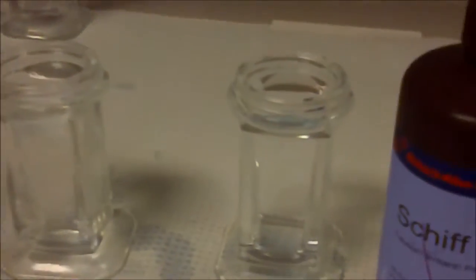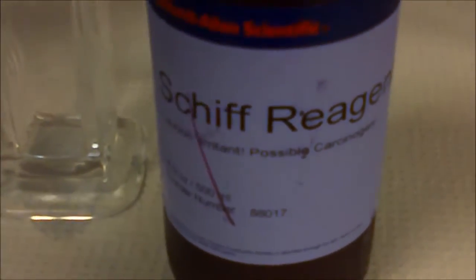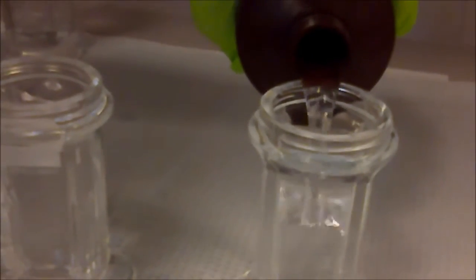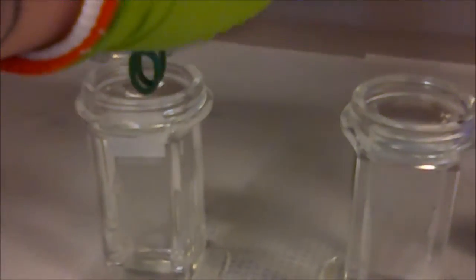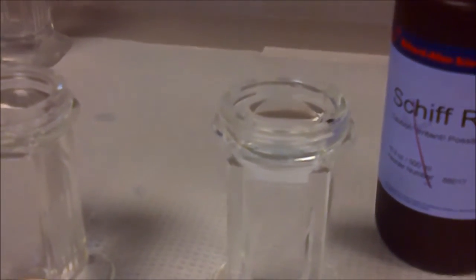Step 4: Schiff reagent. We're going to remove the slide and apply the Schiff reagent for 15 minutes. The reagent has to be allowed to warm to room temperature at this point. We're going to let that wait for 15 minutes.